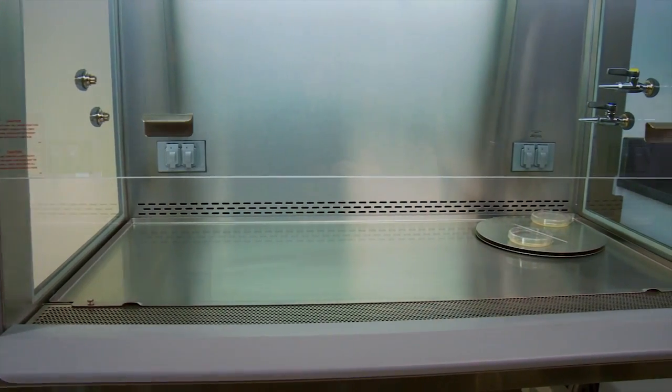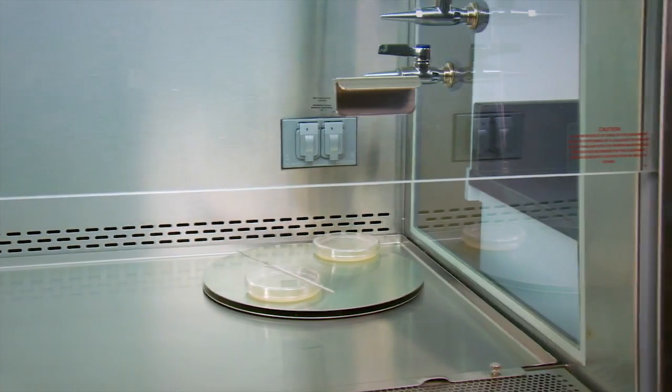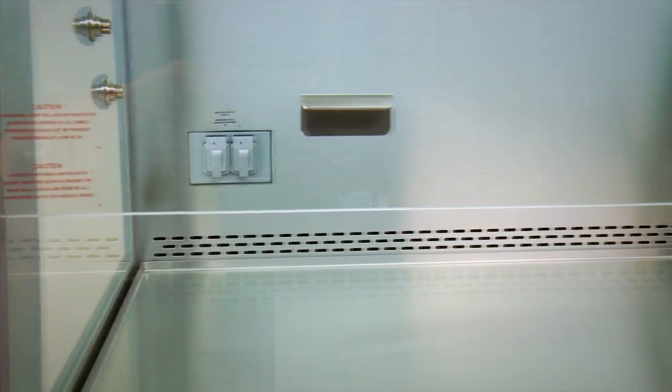The frameless polished edge window in NuAir cabinets allows for greater visibility and better sight lines to the effective work area. This reduces awkward posture, resulting in less eye fatigue and neck strain.